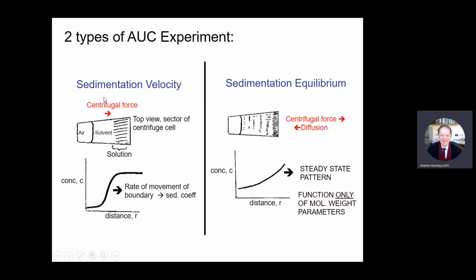After a period of time, under the influence of a centrifugal field, if you're looking down on this, what happens because of the centrifugal field? The molecules will sediment through the solution, and eventually get to the bottom. It doesn't all pile down straight away. Well, it will if it's all big particles, but for a protein, even at 50,000 RPM, DNA, polysaccharide, it takes a long time, it takes hours. It's a slow process.